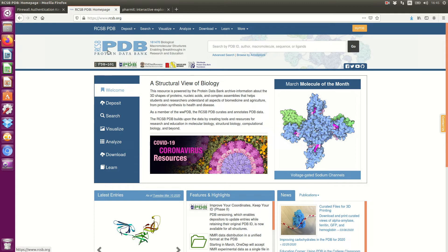I am in PDB, the Protein Data Bank, and I will search for the target. This method uses a ligand-based drug design approach. I am searching for the protease of coronavirus.